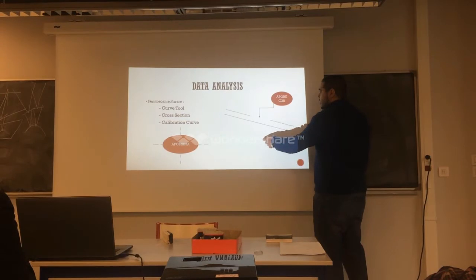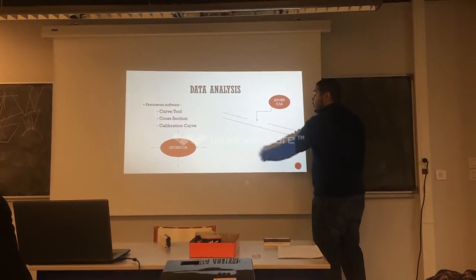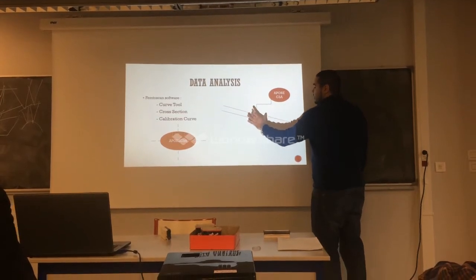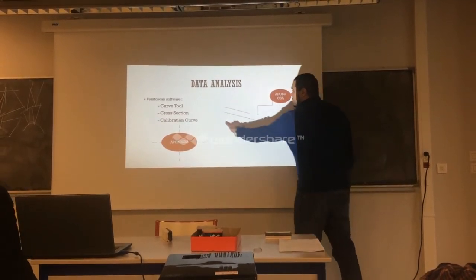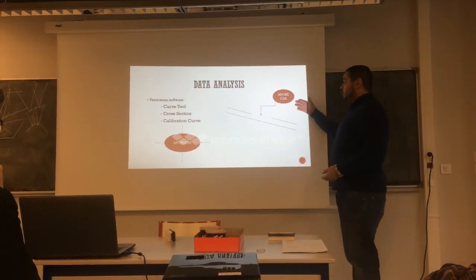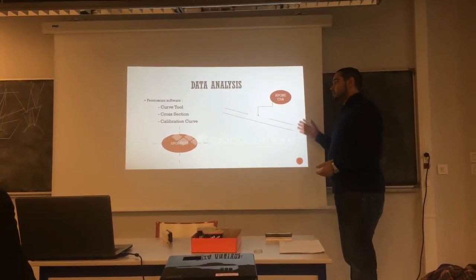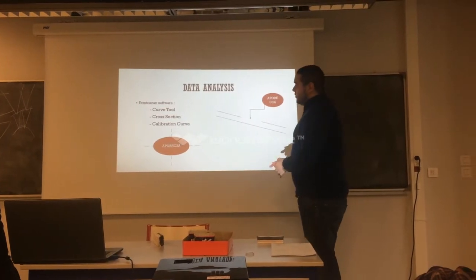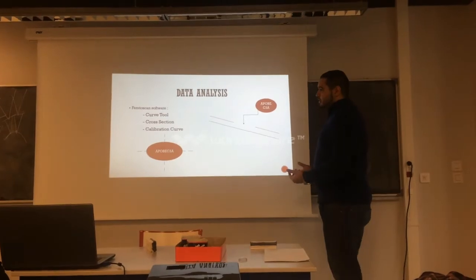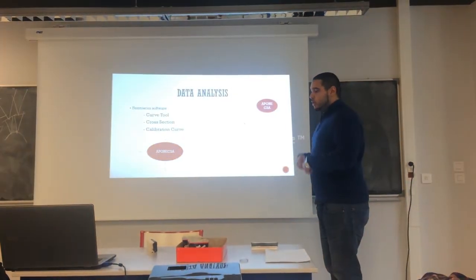Now, knowing the position of the single-stranded DNA inside the whole hybrid, we can calculate the distance between the binding site and the ends of the hybrid DNA, therefore identifying if the protein linked itself to the single-stranded part or double-stranded part. The other thing about FemtoScan software is that it is able to calculate certain dimensions of the protein, including the volume.